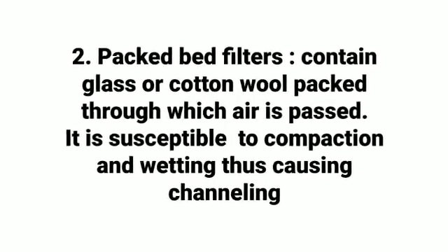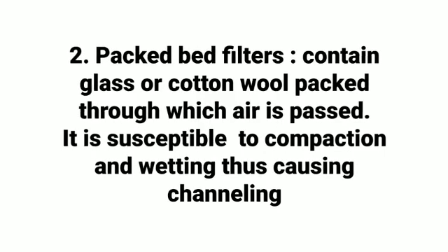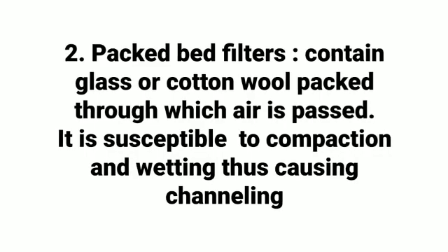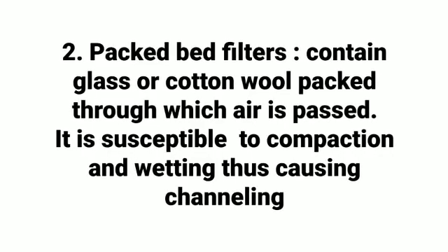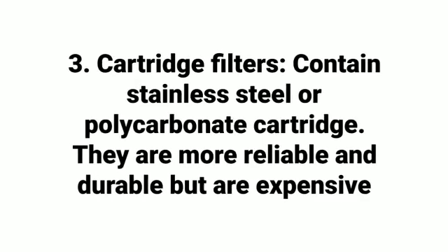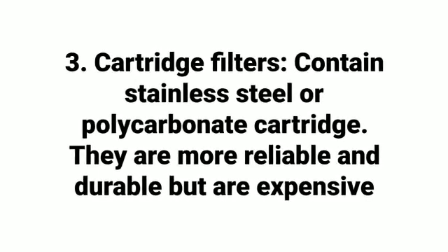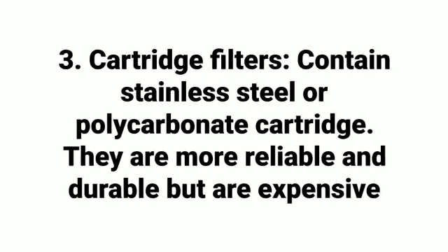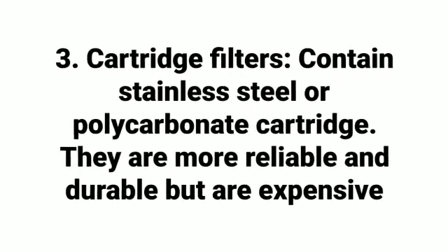It is susceptible to compaction and wetting, thus causing channeling. Cartridge filters. It contains stainless steel or polycarbonate cartridge. They are more reliable and durable but are very expensive.